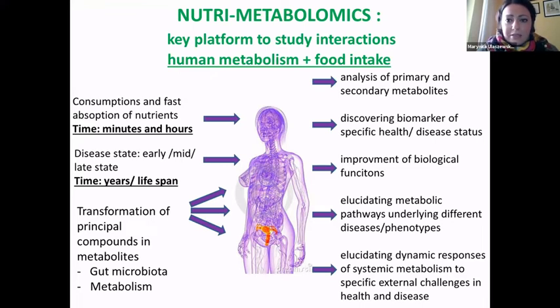Nutri-metabolomics is excellent to study primary and secondary metabolites, and to investigate improvements of biological functions, of course elucidating the metabolomic pathways underlying different diseases and phenotypes, and elucidating the dynamic responses of the system metabolism to specific challenges, in health and disease states. In this case, that would be food intake.